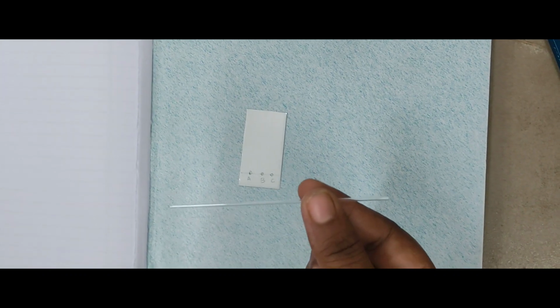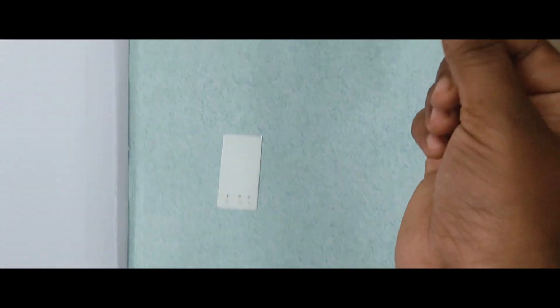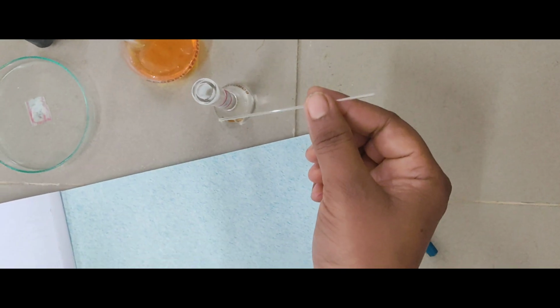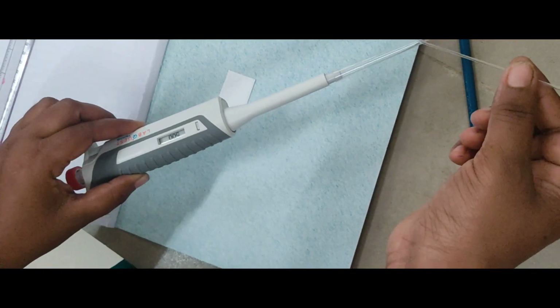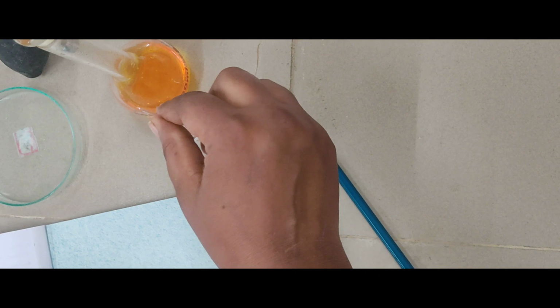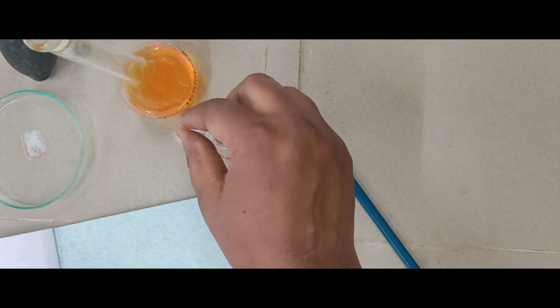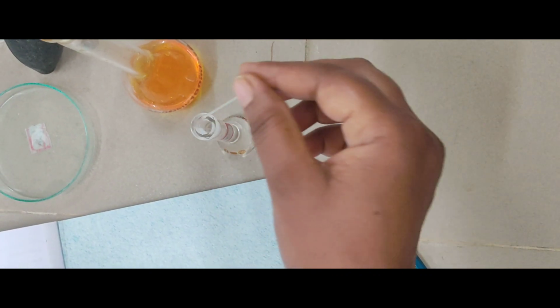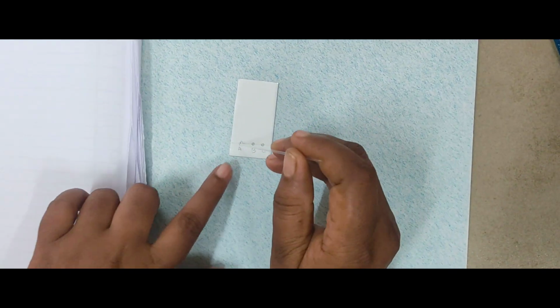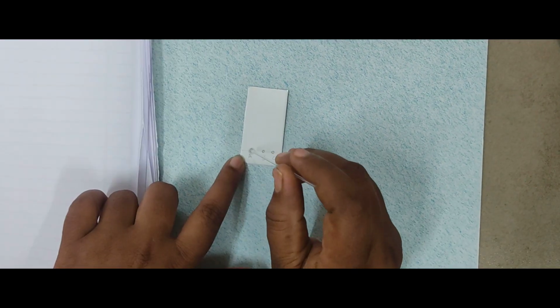Take a capillary tube for sampling, or you can use a micropipette also. From the API stock of 100 μg per ml, draw the solution using the capillary tube and place 1 drop in circle A, which we already made.